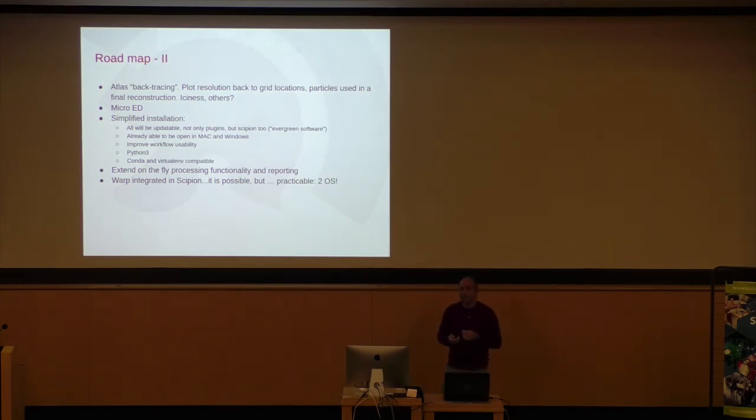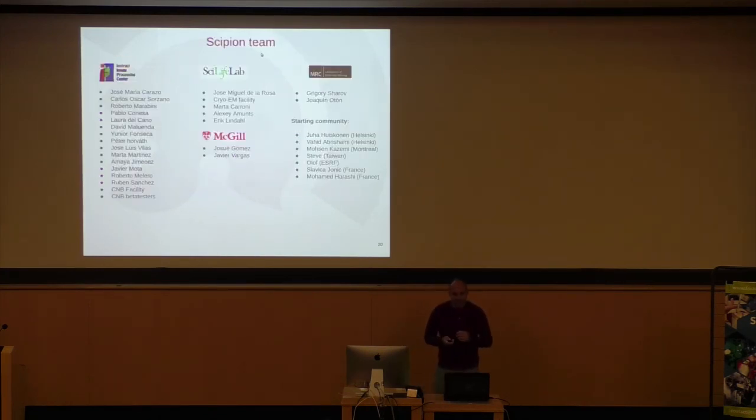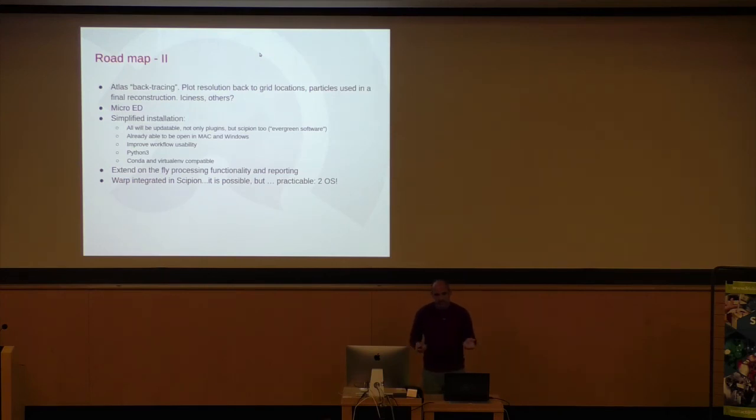Warp, Dimitri. I think we need to wrap up. Okay, I think that's the last one. We tried Warp. I think it's excellent software. It is possible, but I don't know if it is practical. You need a different OS. Scipion runs on Linux, Warp on Windows. I don't know if in a facility you will have two systems and want to integrate them. Obviously, it will not be as fast as running only Warp on the same machine, but it's possible. And I don't know if at some point we will integrate Warp in the pipeline.